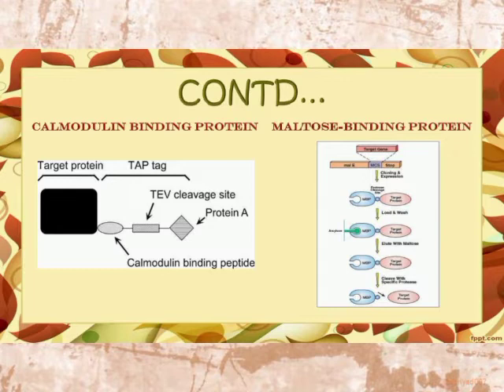So the MBP fusion protein is bound to an amylose resin, which is eluted by running maltose in an elution buffer. This method is fairly resistant to denaturants, reducing agents, and detergents. But any amylase activity in the cell lysate may reduce the efficiency of the amylose resin. These tags bind to the amylose agarose and are commonly used to increase the solubility of fusion proteins.